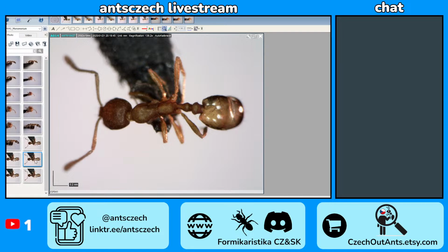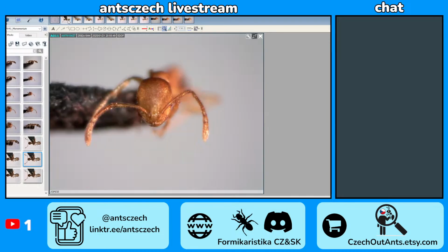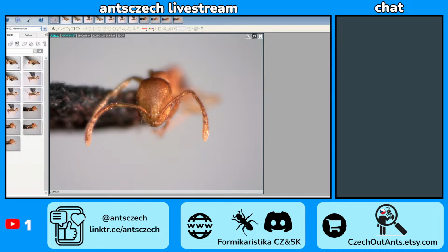I realized that I put wrong annotation, wrong number to like 20 pictures. I have to change that. Really amazing stuff. Wrong specimen number. Yuppie.